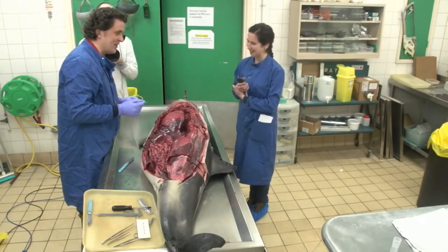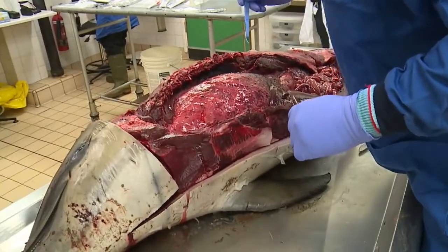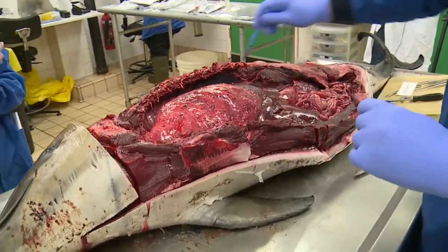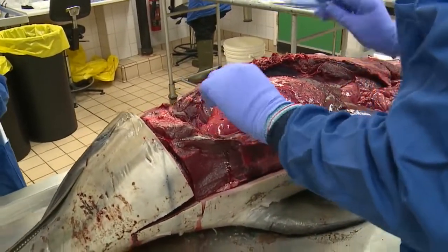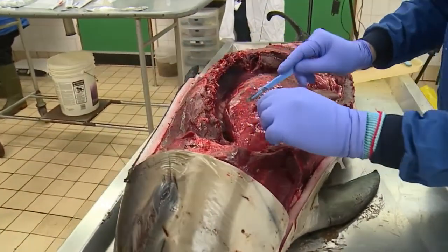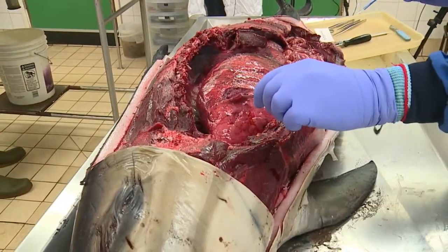Next time. Okay. So the other thing to note is this lung is quite pink and inflated, but it is quite dark at this lateral end. That's coincident with this area of hemorrhage over here, so we'll take some photos just in case. We have a sterile scalpel blade and some forceps. Just make a cut, expose that lung tissue.